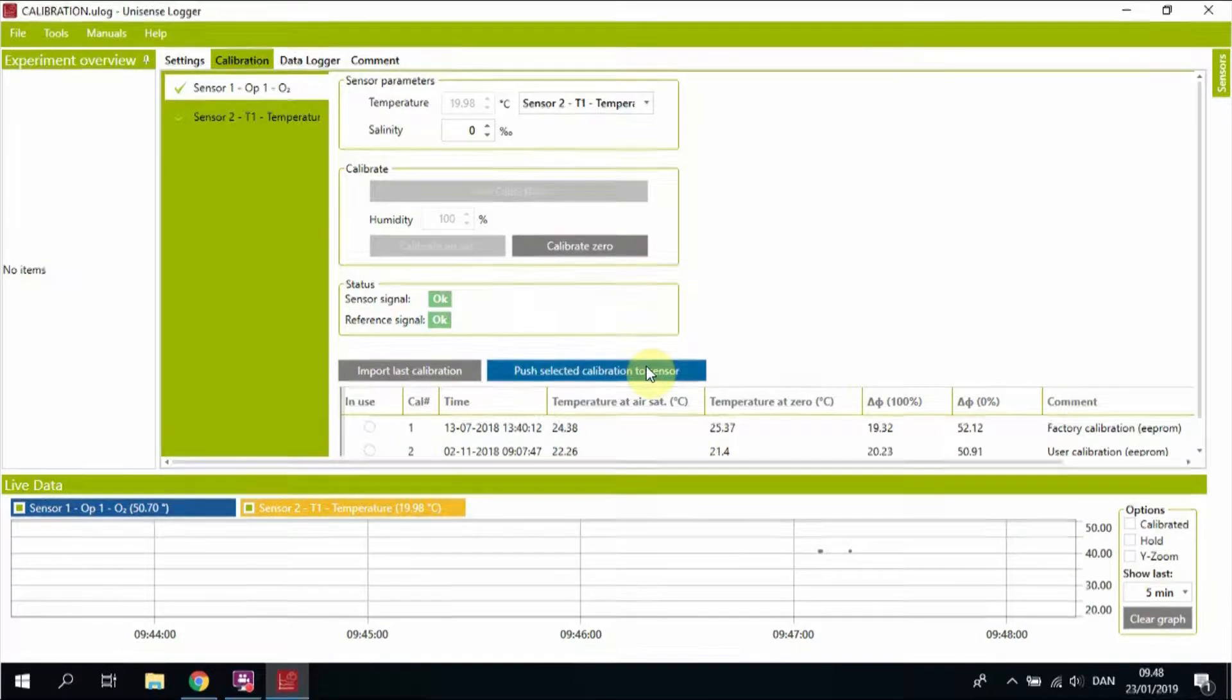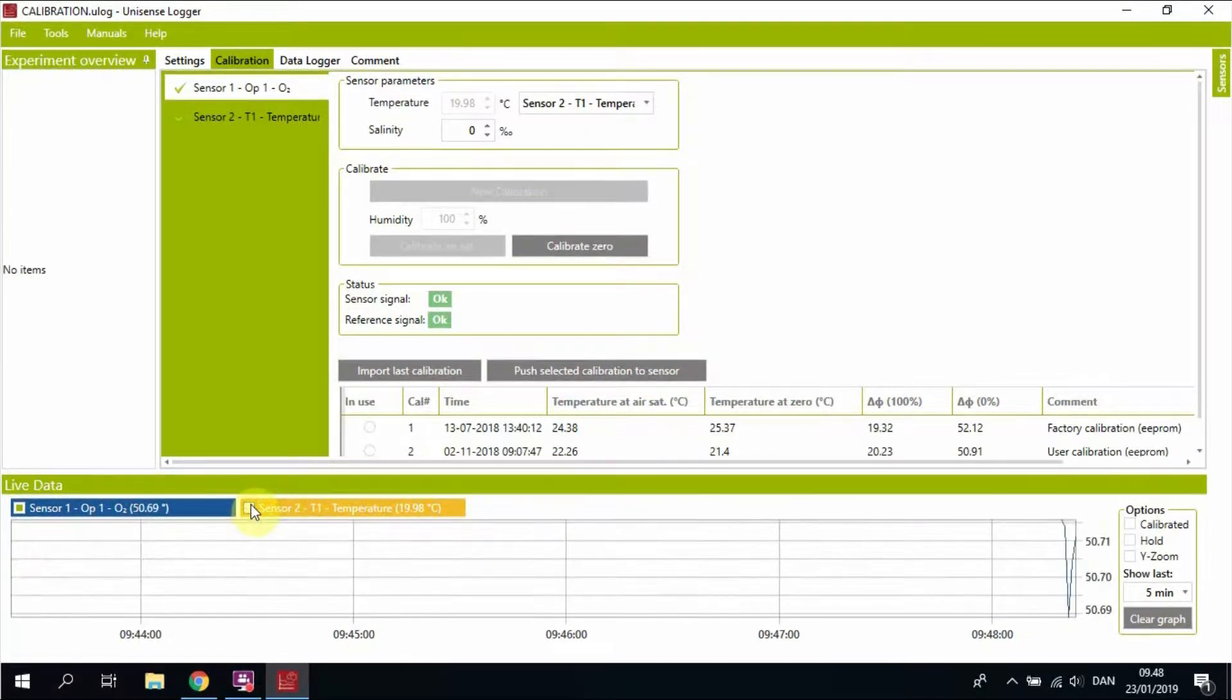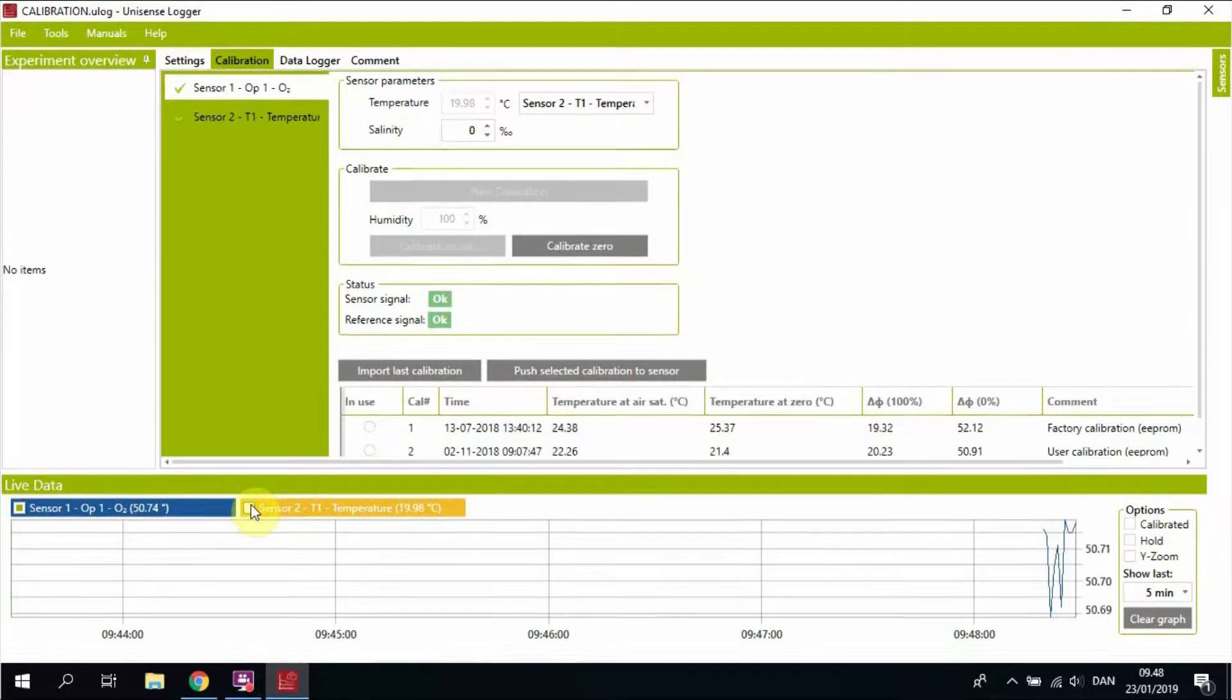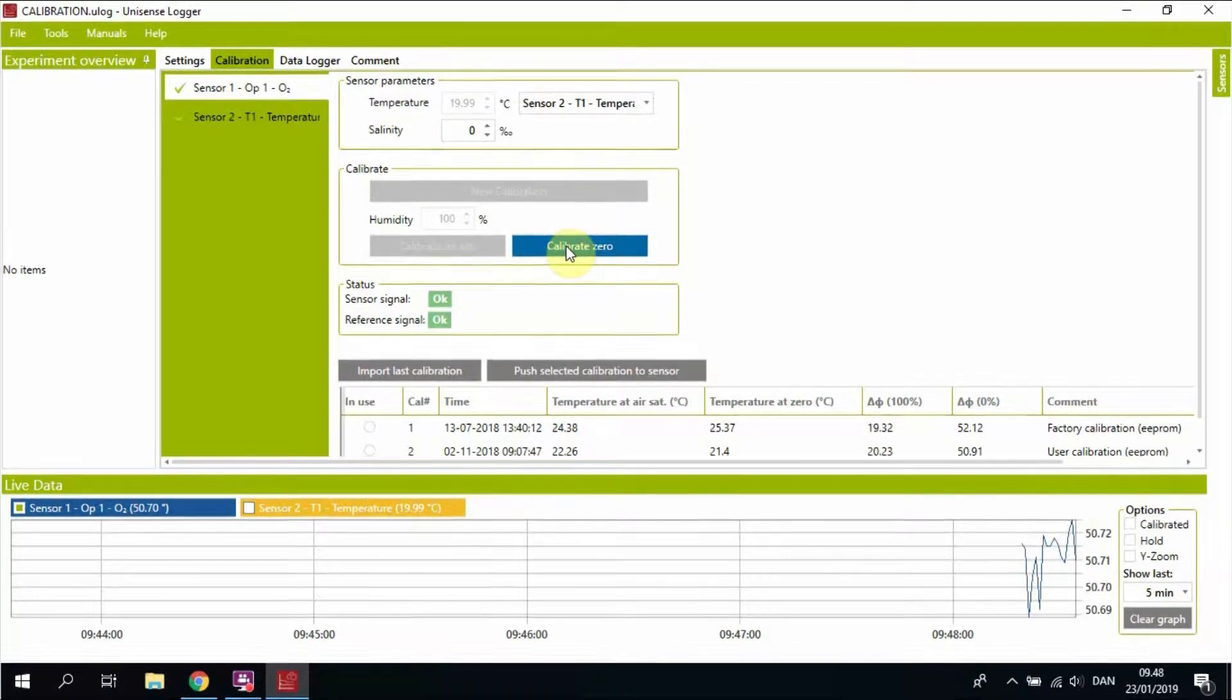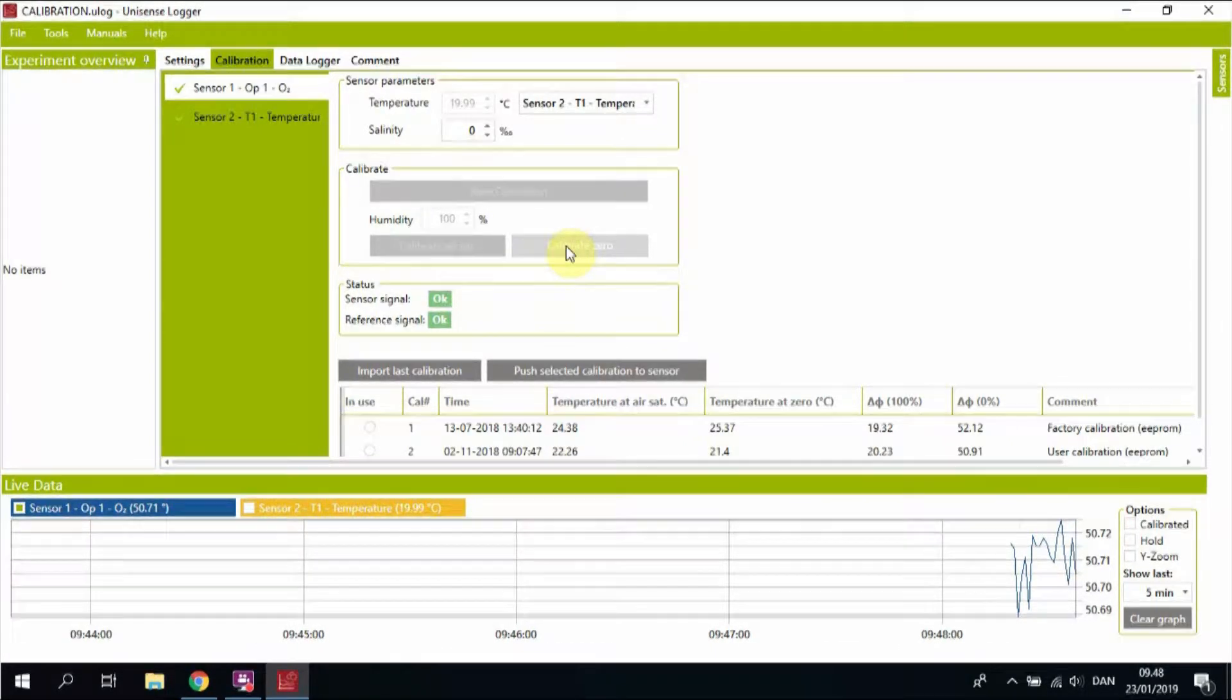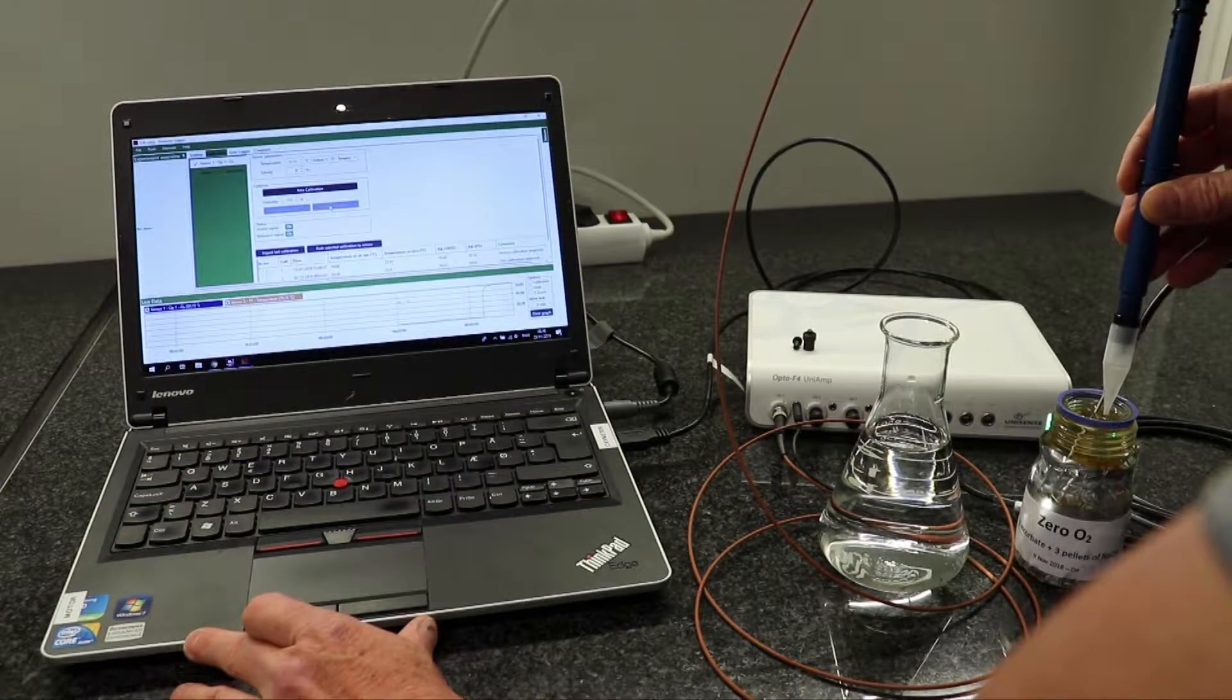You can clear the graph in order to change the scale. Also clear the temperature signal. So now you see that the signal is actually fluctuating between 50.70 and 50.72. This is pretty stable, so you hit calibrate in zero.